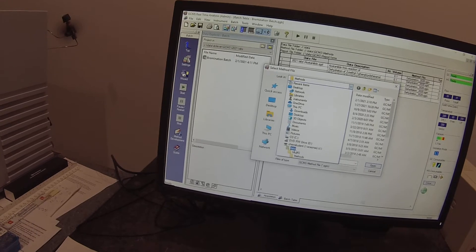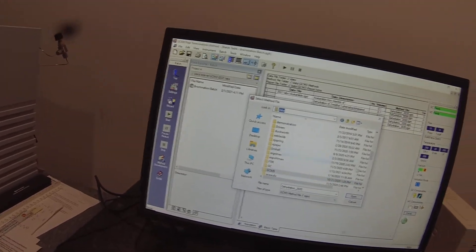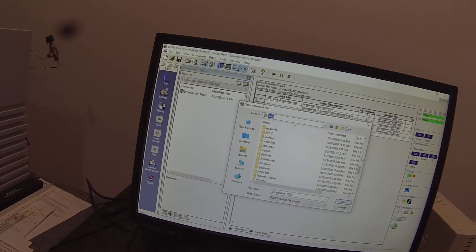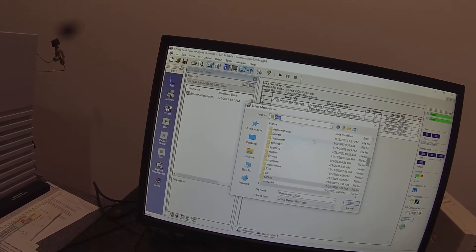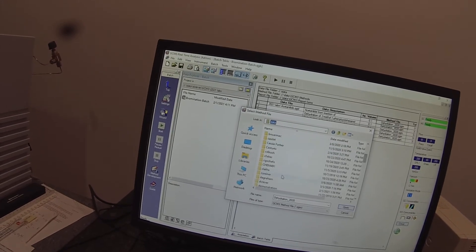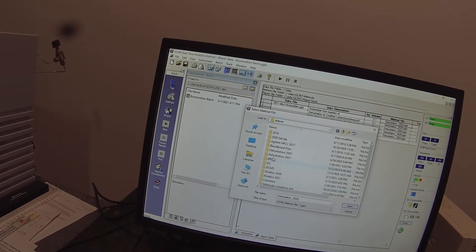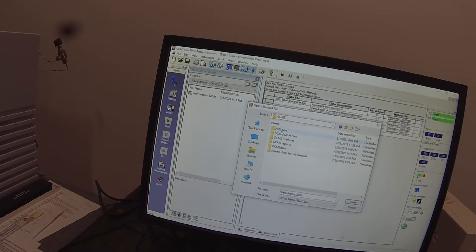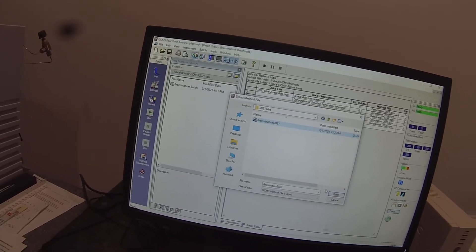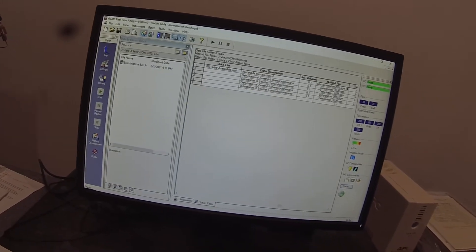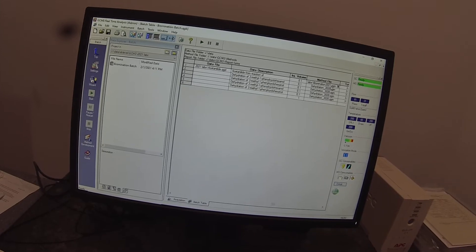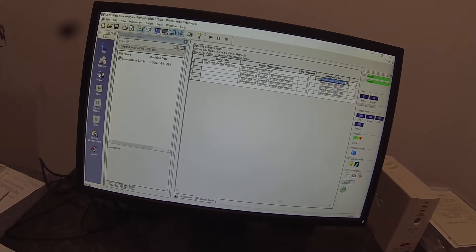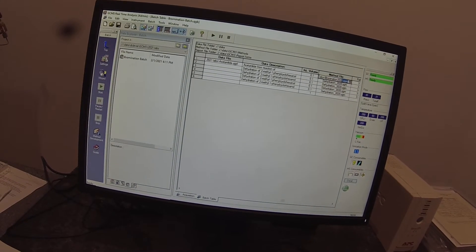0.1 microliter injection volume is correct. The method that we want to use is actually under my own folder, under GC mass spec in those 2021 labs. It's called Bromination 2021.